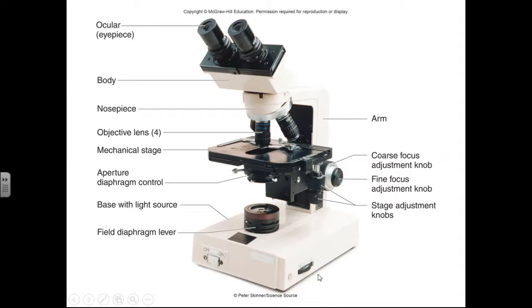Most electric microscopes will have a small knob on the side or a dimming knob, plus a manual on-off switch. I remember the first classroom I taught in had old school microscopes with nothing but concave mirrors that you had to adjust. We could only use those microscopes if it was sunny out. And then I'd have my students sit in the sunshine, because that was the only light source we had that was bright enough, and the sunlight would bounce off the mirror and go back up into the specimen.